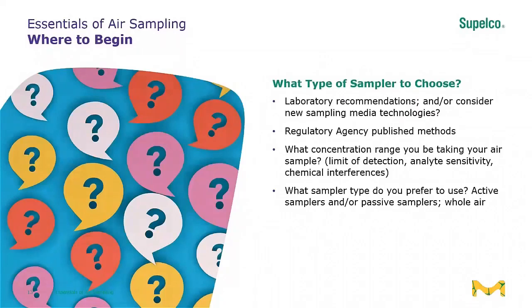Contact the laboratory and ask them if they've heard of it, and two, if they can test it. That can also be something in your pocket to help you determine the right device for your application.